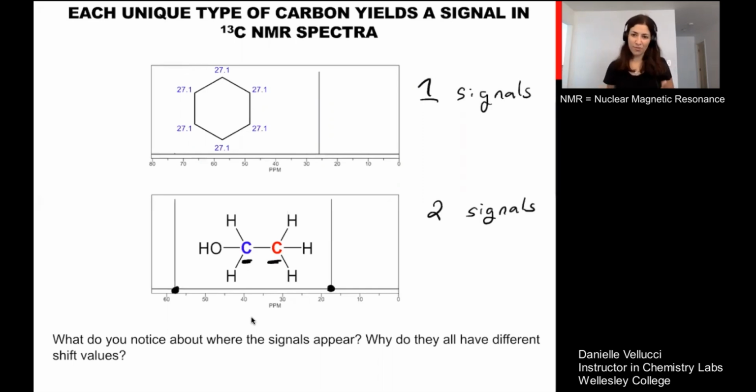So the final thing we want you to understand about C13 NMR at this point in time is that the neighborhood where your signal is found, we call this a chemical shift. Okay, so the number on the x-axis is dictated by what the carbon is bound to. So it reflects what that carbon atom is attached to.